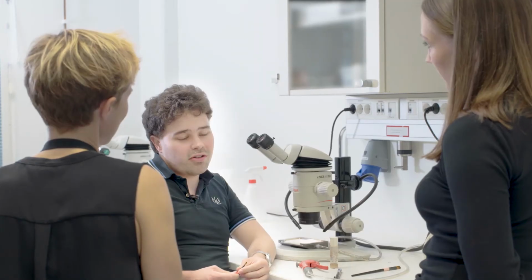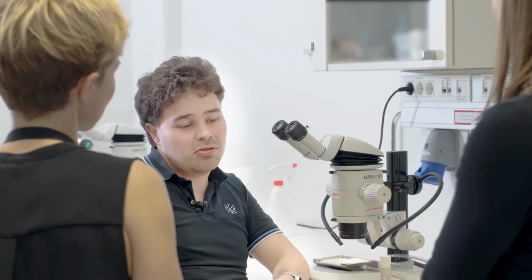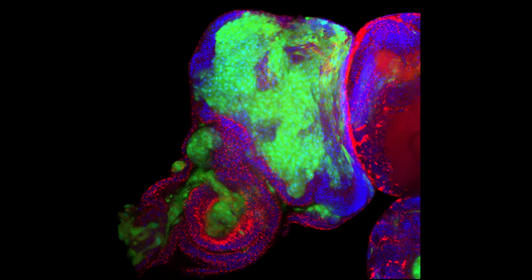So you mentioned tumors in the fly, and I know that you work with cancer. So how do you turn a normal Drosophila cell into a cancer cell? First, I would like to mention that to study tumors, you need to do crosses, because if you have a tumor-carrying fly, then it will die soon.